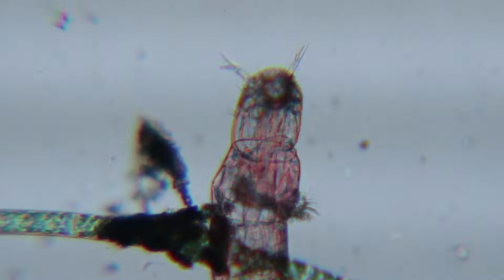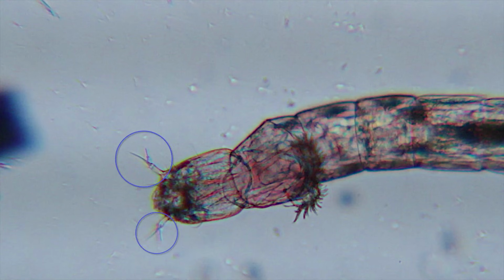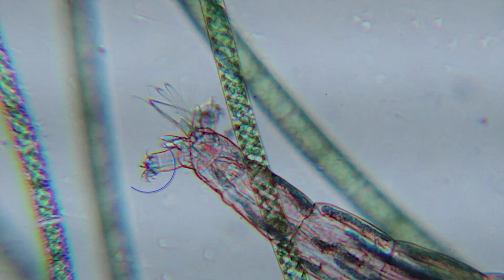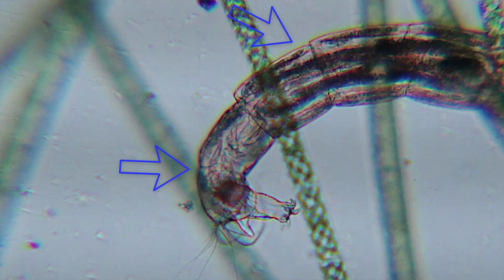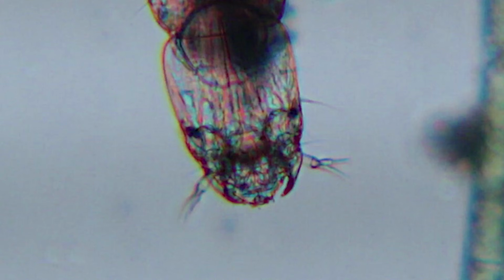Let's look at some stills so we can get a clearer look. He's got two probably touch-sensitive feelers, claws on his forepaws for gripping the Spirogyra, and claws on his rear end as well. These are retractable so he can move his rear end forwards with his very flexible body. And look at those jaws, definitely made for killing.